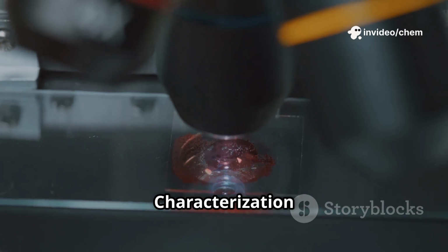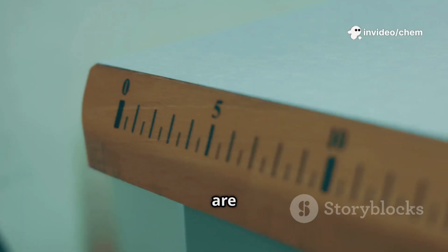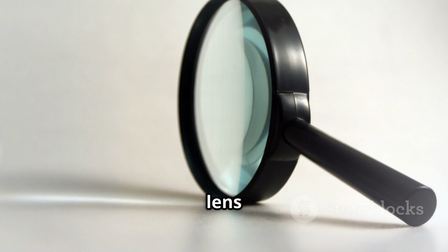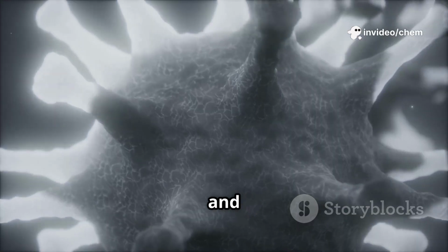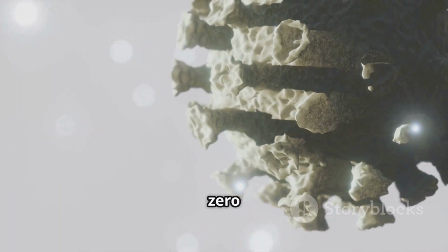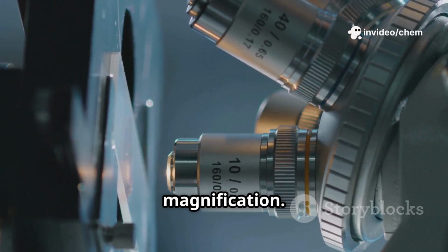Introduction to characterization techniques. The human eye has some limit to resolve 2 points that are 0.2 millimeters apart, called the resolution power of the human eye. However, by addition of lens or group of lenses, also known as the aided eye, the human eye is enabled for high resolution and can resolve 2 dots that are closer than 0.1 to 0.2 millimeters. Anything below 0.1 to 0.2 millimeters requires some sort of magnification.